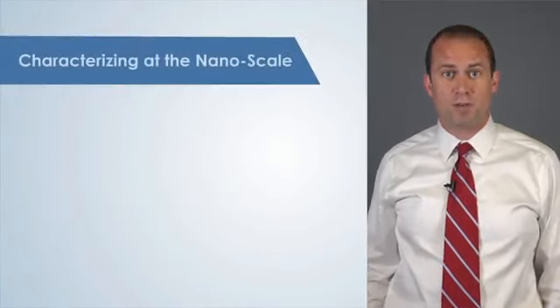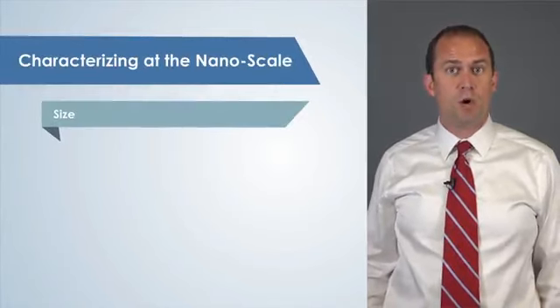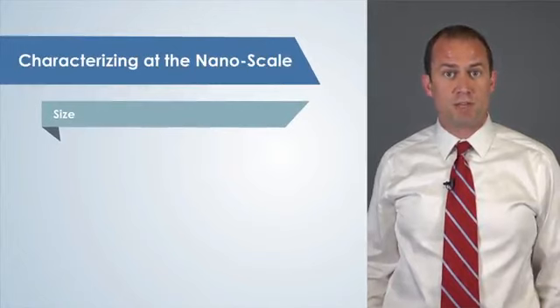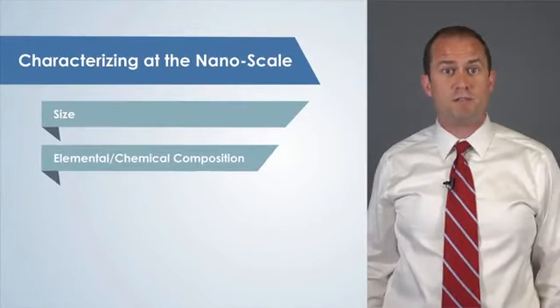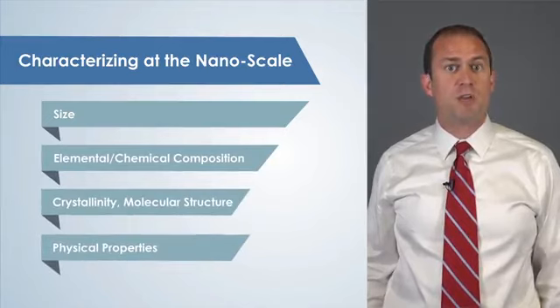Properties that we can determine using nanomeasurement tools include how big, or in our case how small, something is, what it is made of, information about the molecular structure, and the strength of micro-sized or nano-sized features. Some tools have the capability to observe and measure how these nanoscale properties change when the material is exposed to external factors like physical stresses, changes in temperature, or radiation.